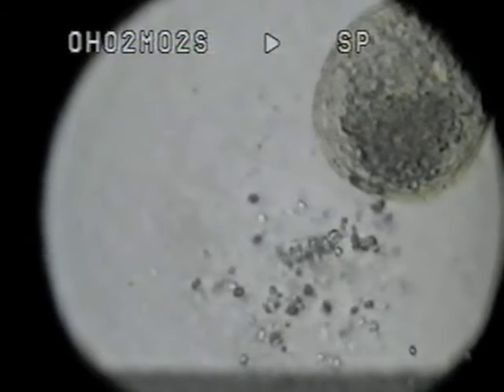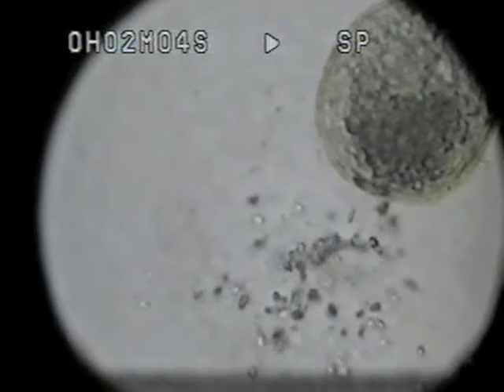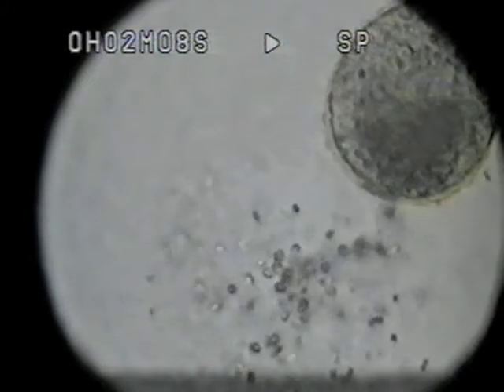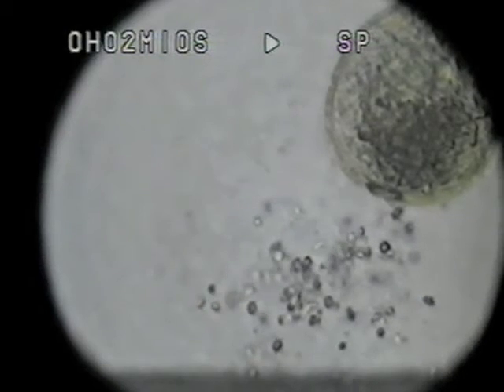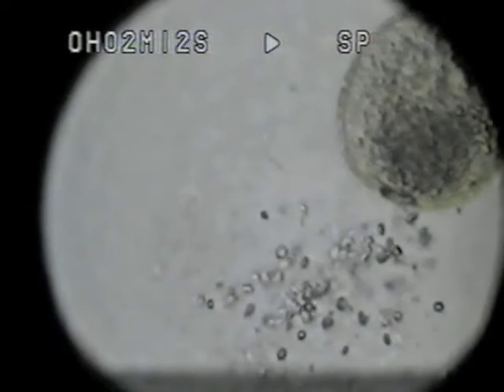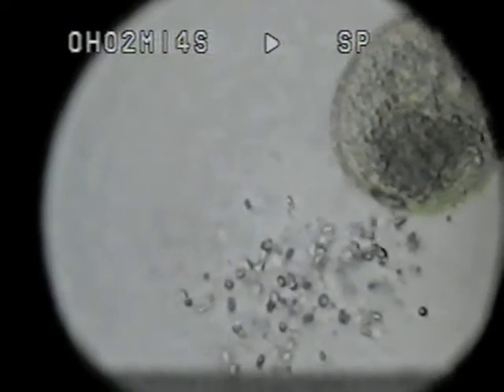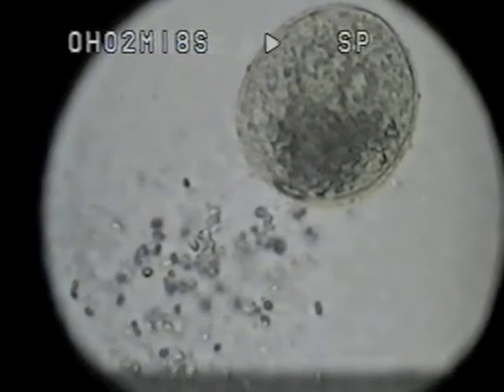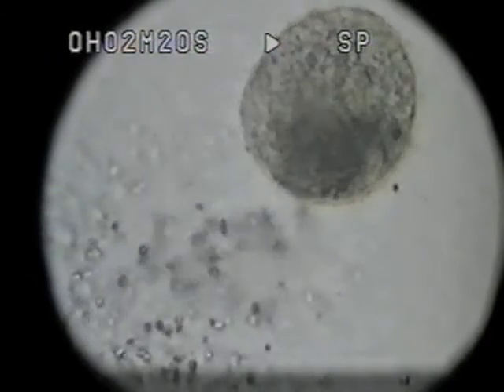Now if I focus on that — there it is. You can see them popping out of the hole. They are pouring out, and there won't be any inside that pollen grain before long. Now that was a bit slower than usual — Cocksfoot usually goes off more quickly than this. Now we are going to try a different sort of grass, and it will be Timothy grass.